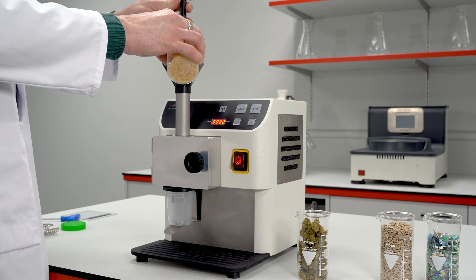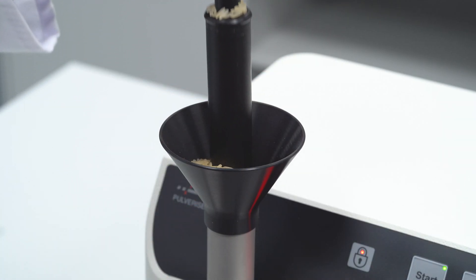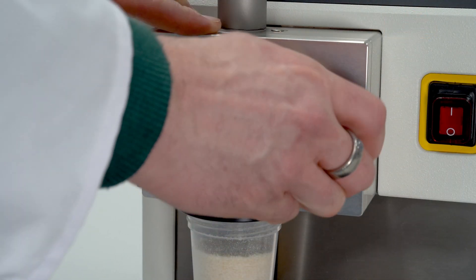The P29 is optimal for milling rice because it generates little heat during the process, thereby preventing damage to analytical constituents. It additionally offers the advantage of a small batch size directly packed in a single-use collecting vessel.